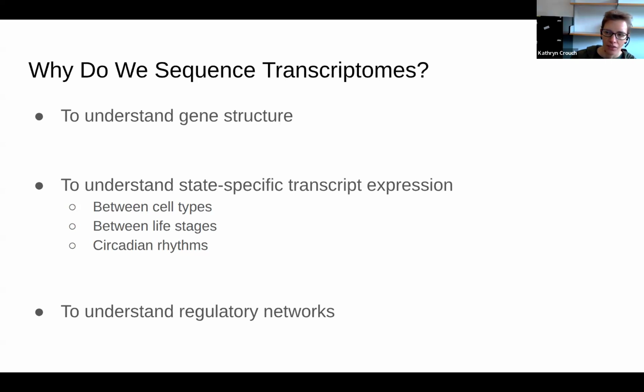Okay, so when we talk about RNA-seq, what we're talking about is sequencing the transcriptome of your organism, your sample. So sequencing all of the things that are being transcribed in a pool of cells. Why do we do it? There's a couple of different reasons for doing this.